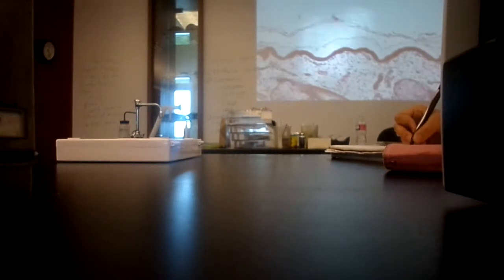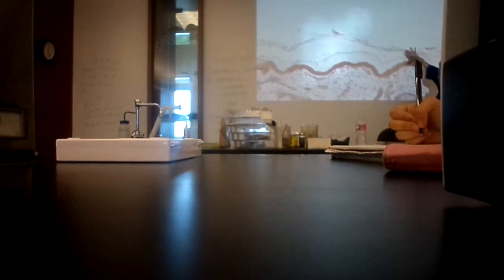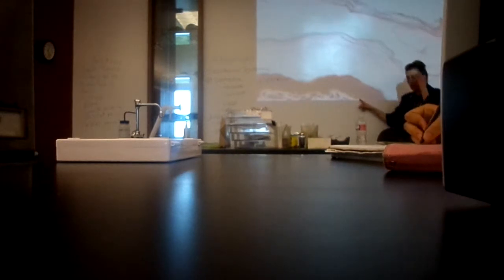All right, so here is the epidermis. I want to look at this layer. Now I'm going to look at it on even the highest magnification here. Here we can see this is the flaky layer that you slough off. Down here at the bottom, on your slide, it's probably going to show up a little bit better.